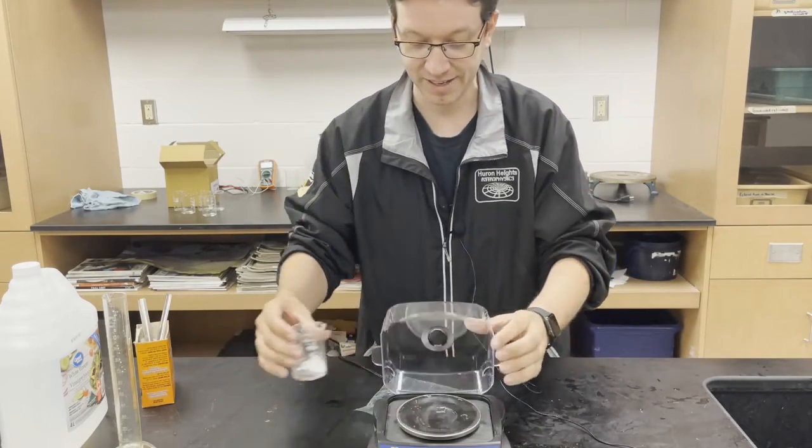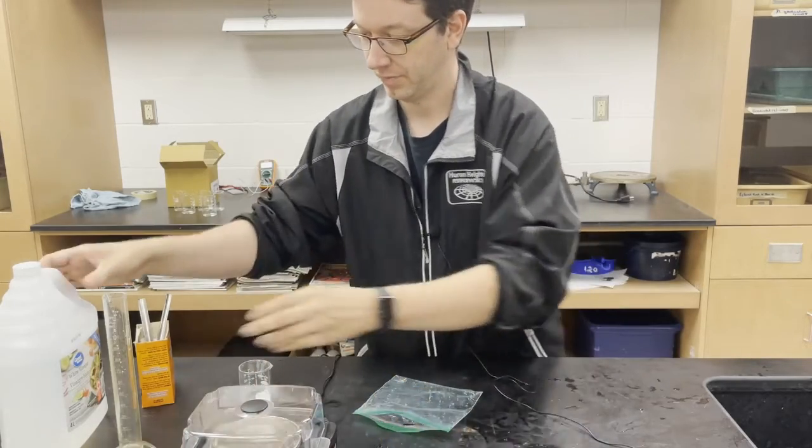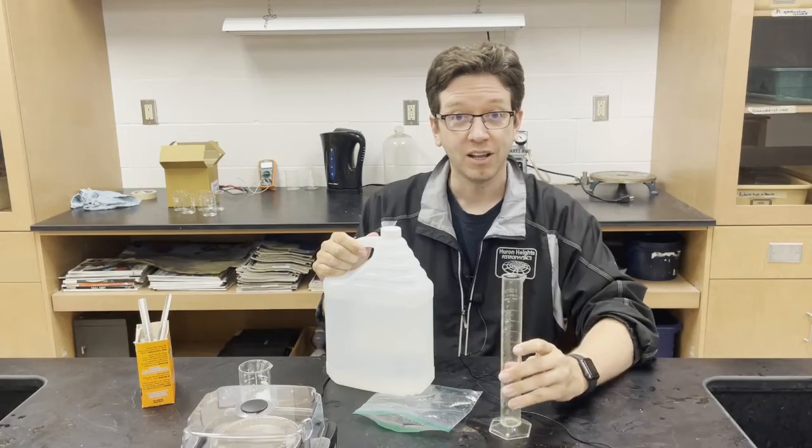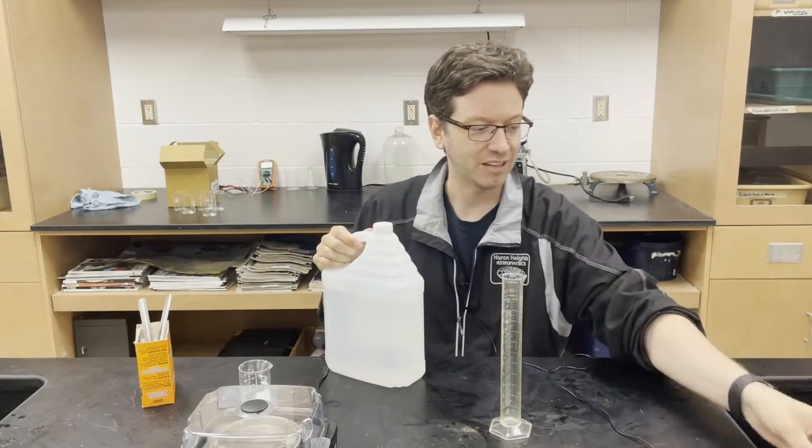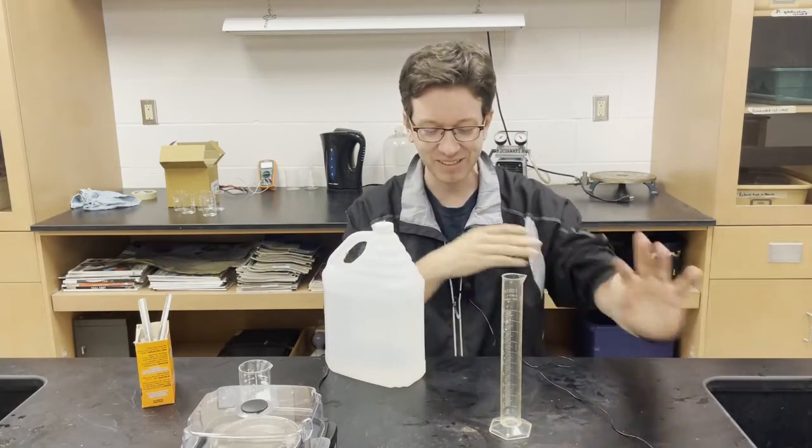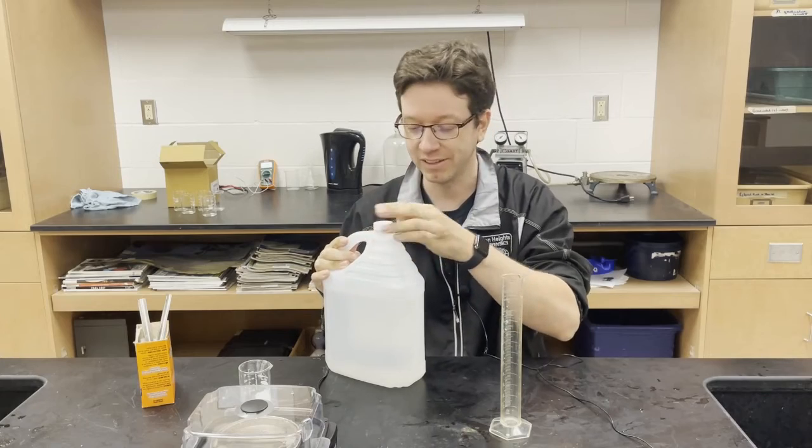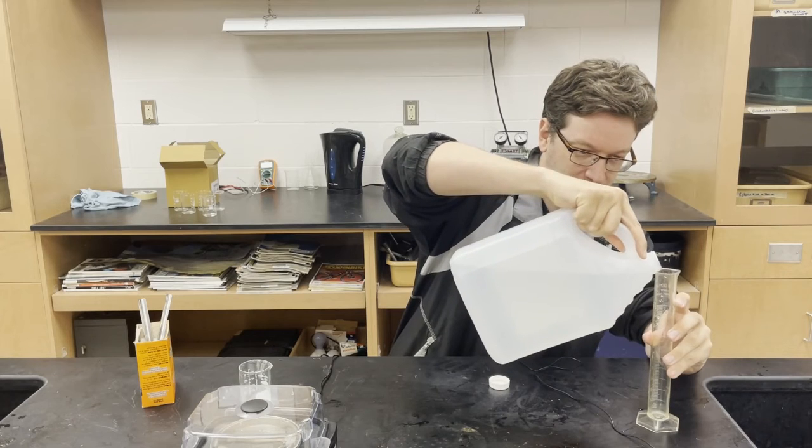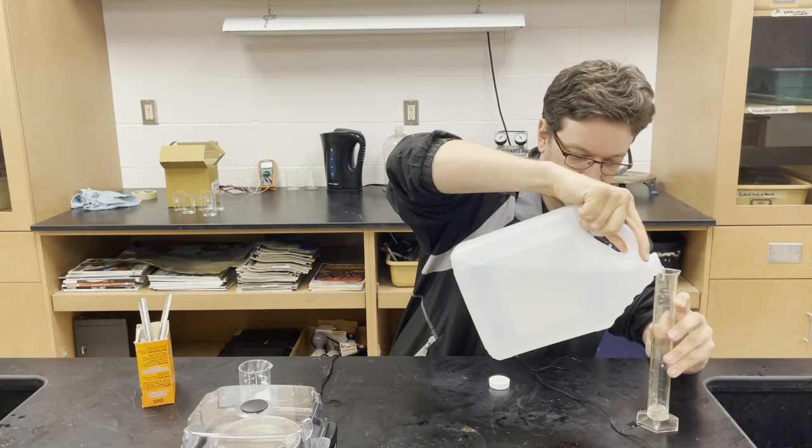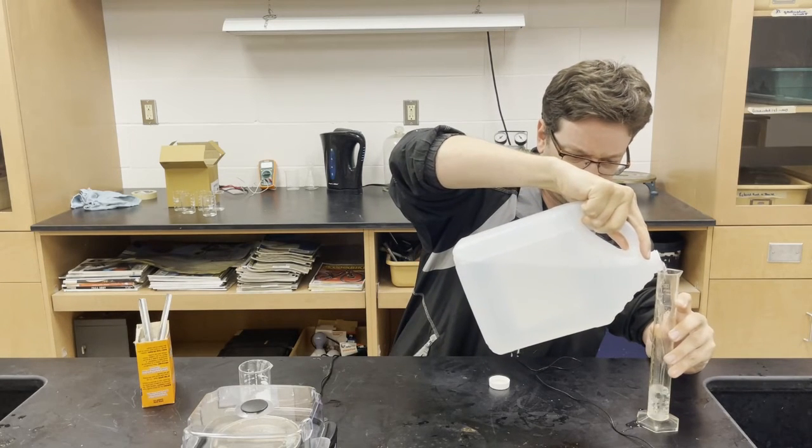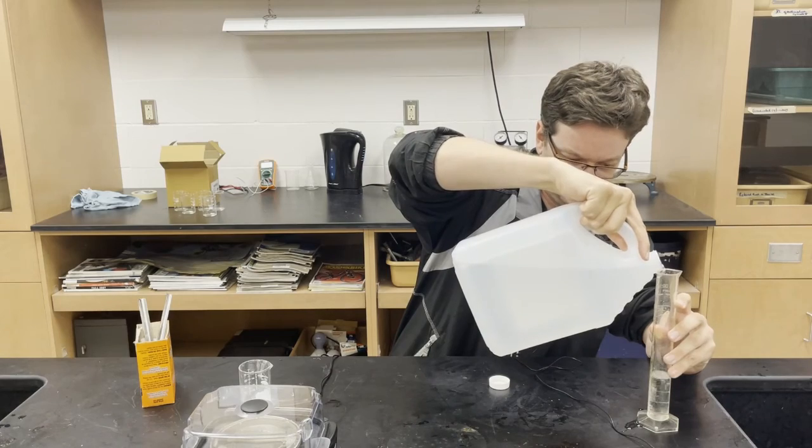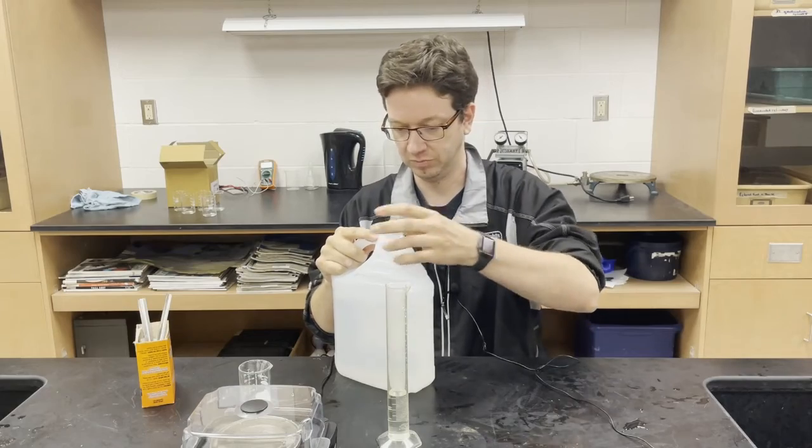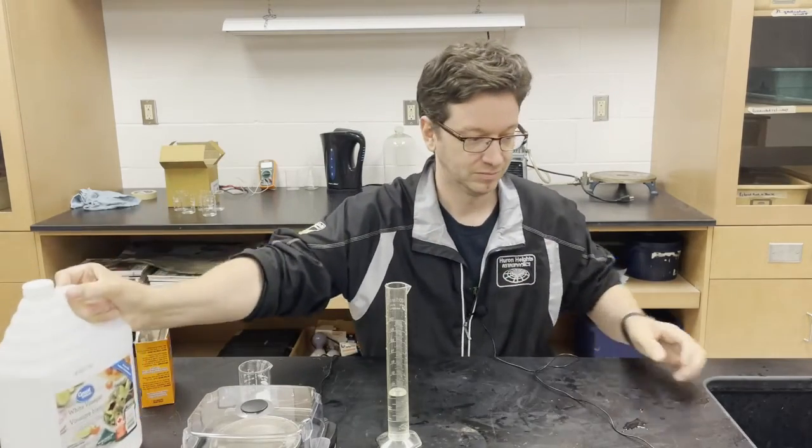All right, so we have our baking soda and we also calculated we need 37 milliliters of vinegar. Now vinegar I want to be in excess, so let me just add a bit more and we'll make it 40 milliliters.